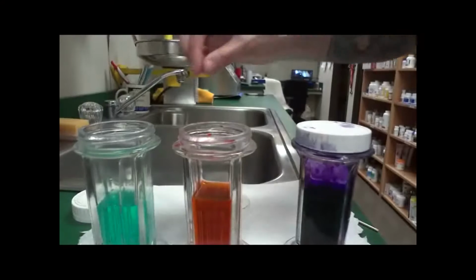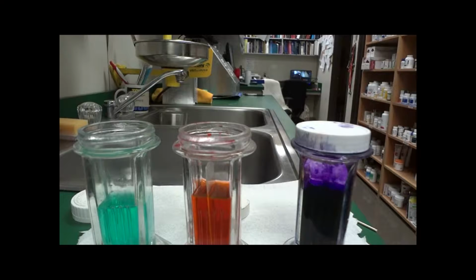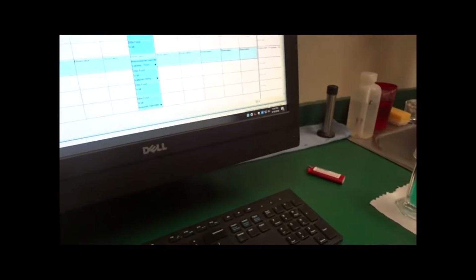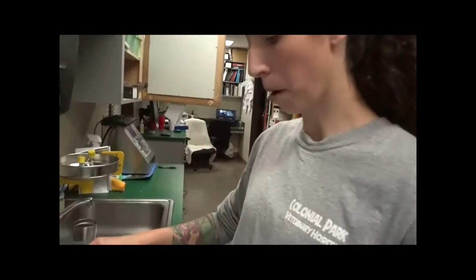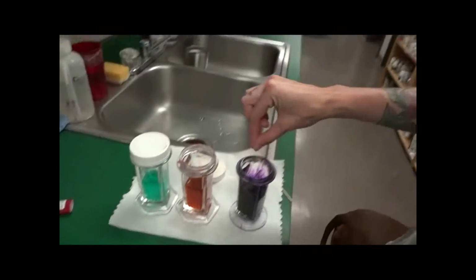Alright, we're going to transfer our slide to the second jar, which is the eosinophilic red stain. It will be in that one for 15 seconds as well. Alright, so we're going to be placing our ear cytology in the last stain, which is the basophilic blue or purple stain. It will be in that one for 15 seconds as well, and then we'll wash it with distilled water and view it under the microscope on oil immersion, 100 magnification.